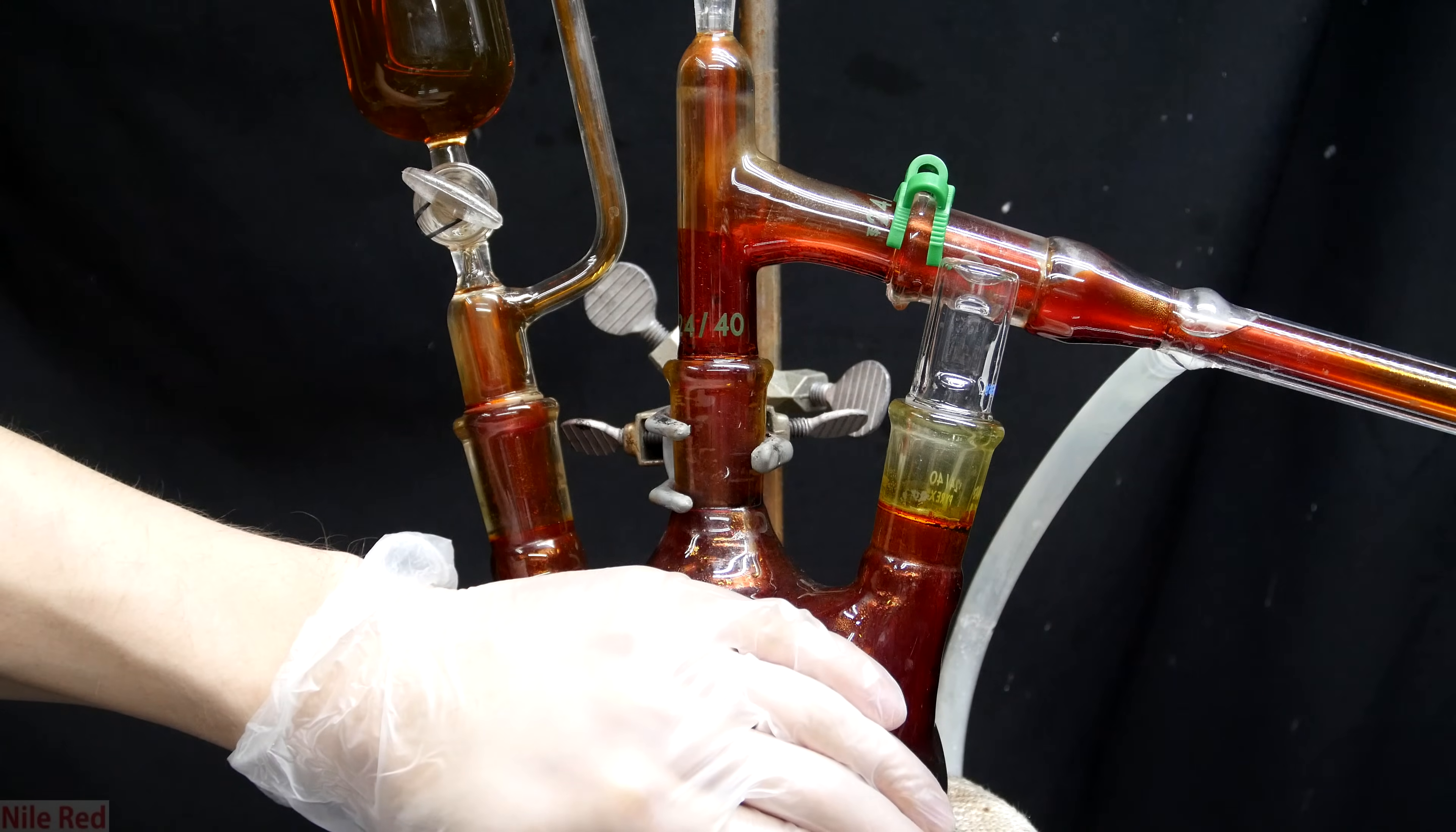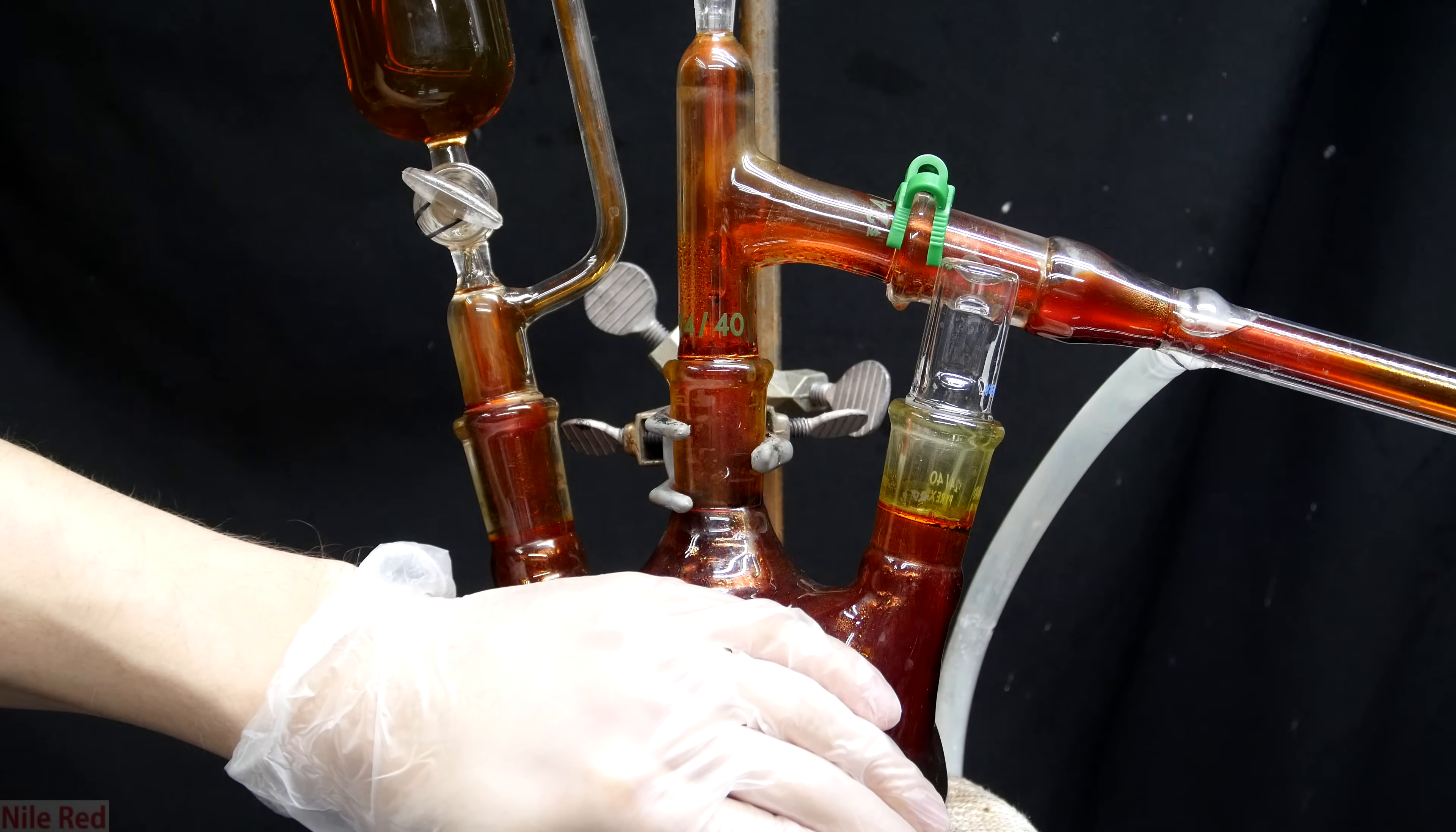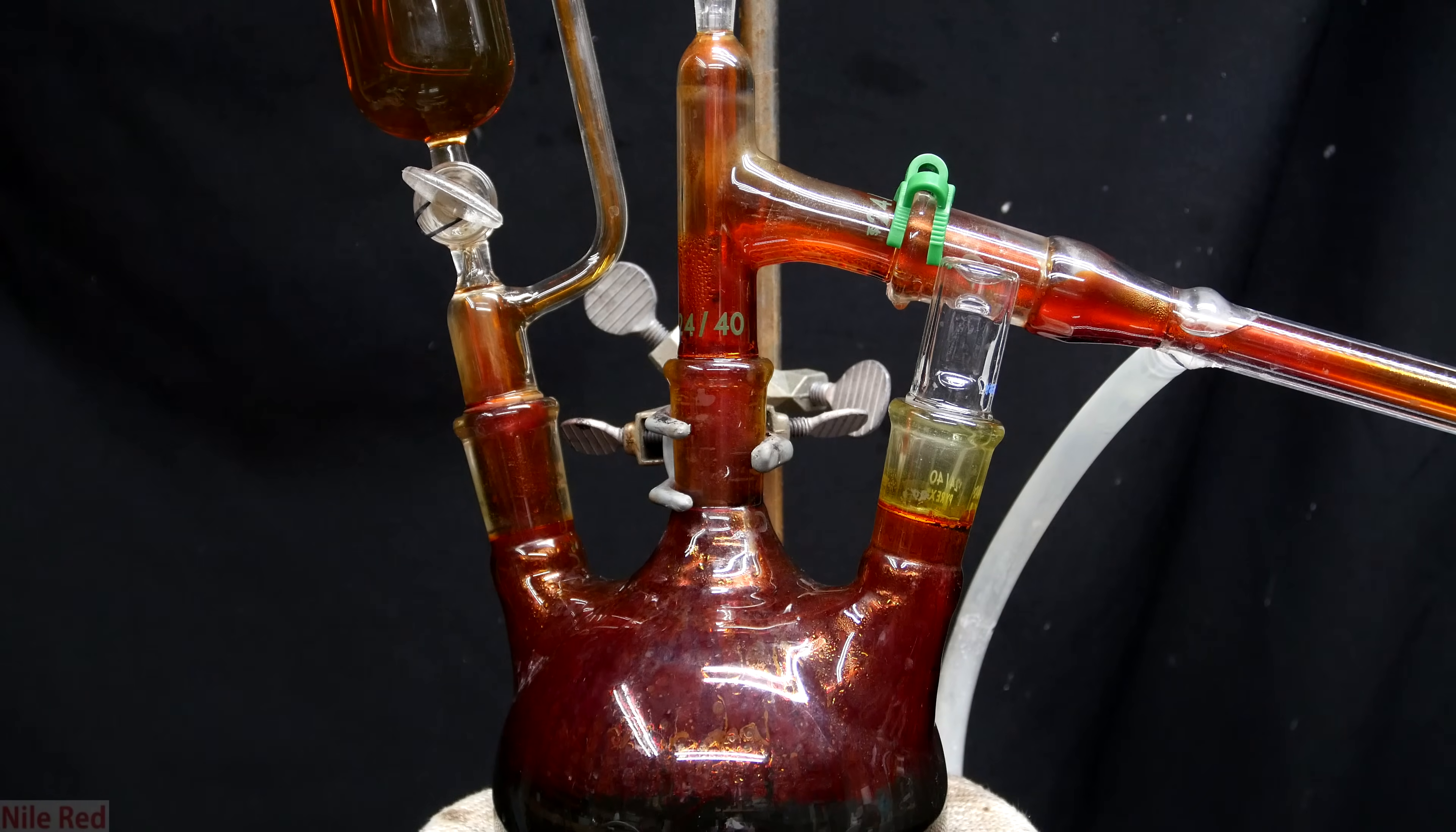Another thing that I thought was cool was if I place my hand onto the flask, I can actually stop the distillation from happening. You can clearly see the vapor front of bromine being pulled down, and when I take my hand away, it starts to climb again.